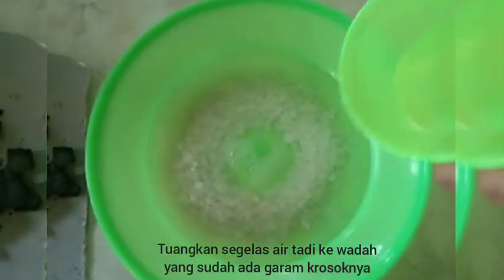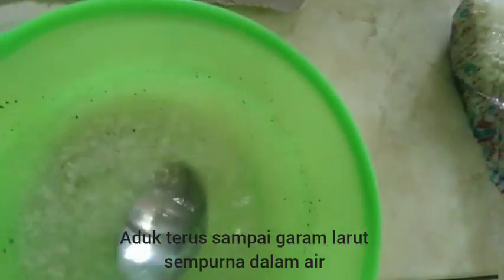The next step is to dissolve the dirty salt in a glass of water until it is completely dissolved.